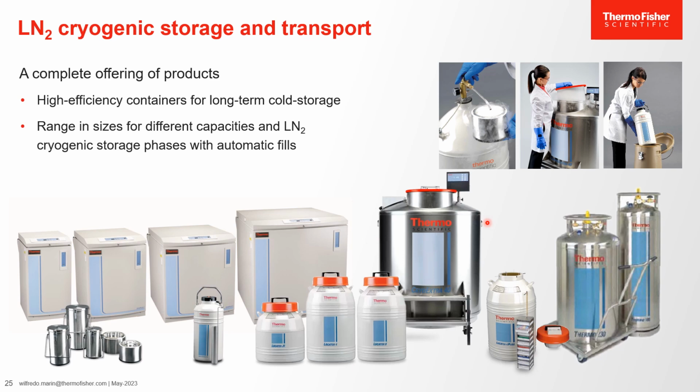As we see, when you're freezing down bags or samples, we'd like to either do short-term storage with a liquid dewar or one of the potential transport or IATA type approved dewars where you can ship these to a collaborator with small subsets of samples. And of course, this is an example of that LN2 supply. Oh, and here we see what that Arctic one would look like in a shell case so that it's protected from any jostling, any tilting or vibrations.